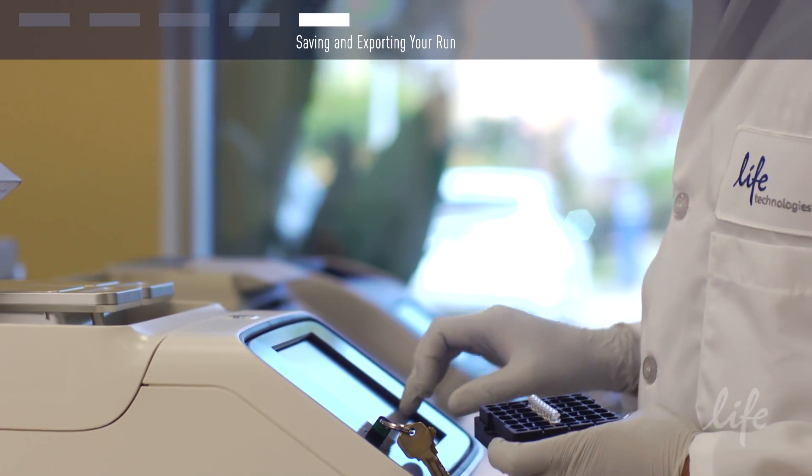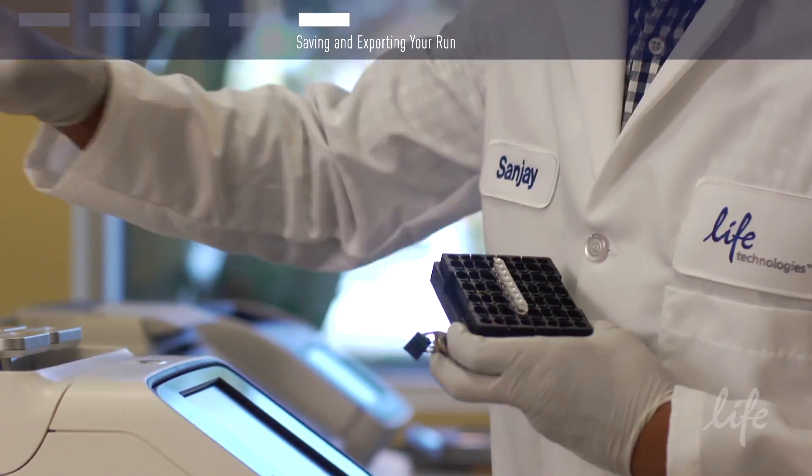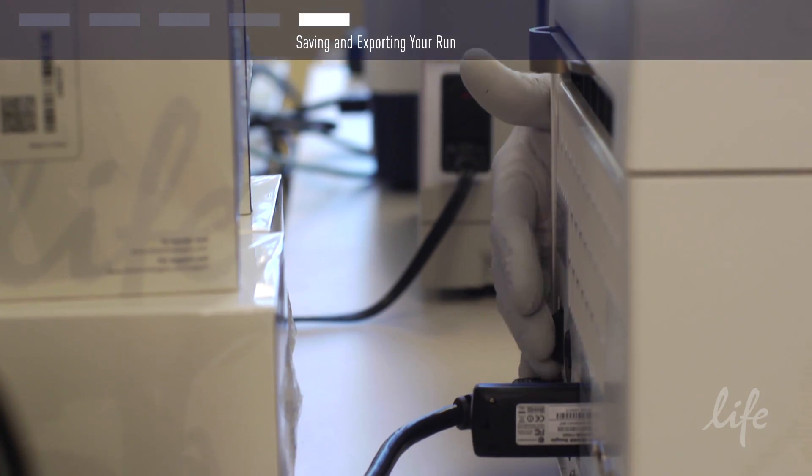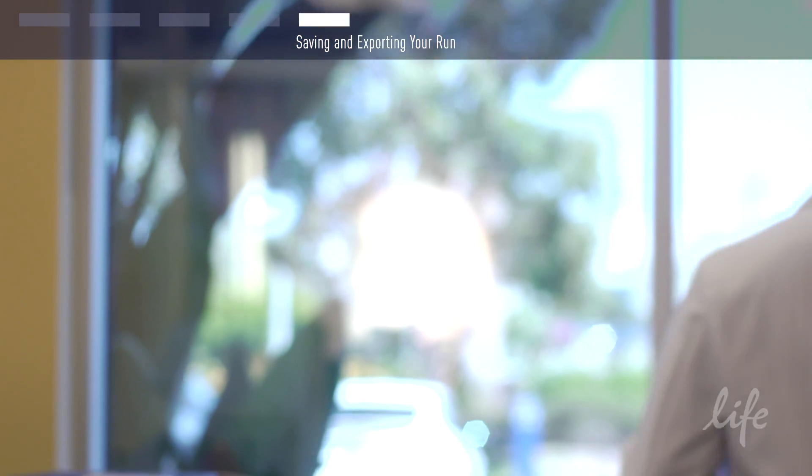You can also save your run history or your method files to a memory stick for printing and saving in your lab notebook. Make certain to shut down your block and turn off the ProFlex PCR system when not in use.